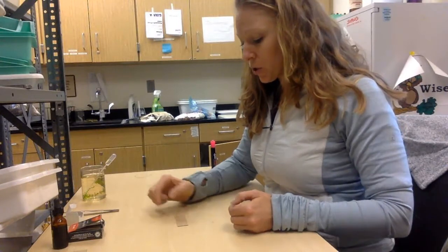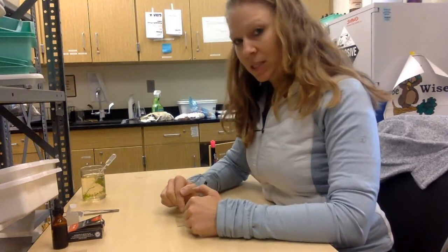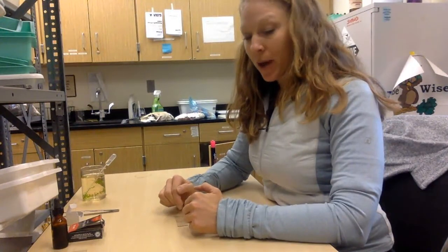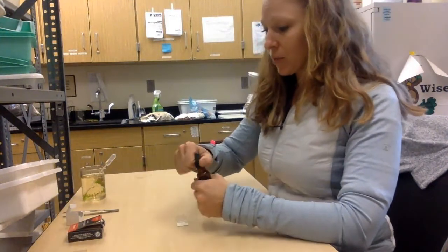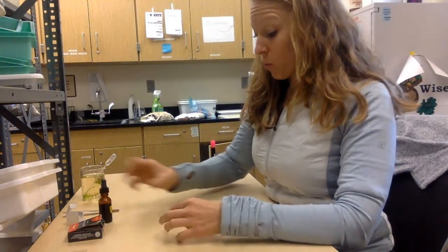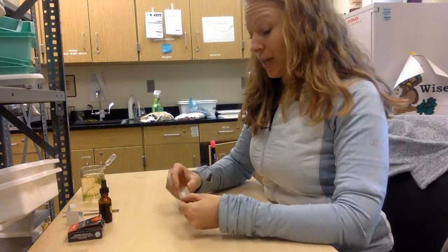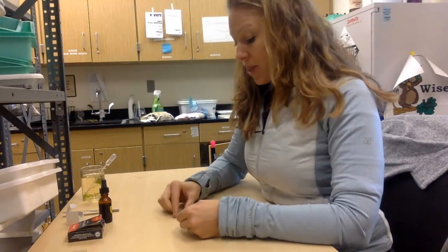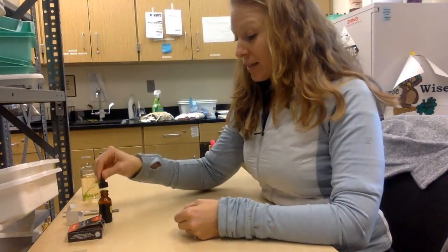Please make sure that when you're done with the cover slips, the cover slips do not end up in the sink, clogging the water. Please don't throw them away. Dry them off, put them back where you got them from. Same with the slides. Then, for the first part of the lab, we're going to be looking at this under the microscope. Then, I'm going to have you guys add stain.